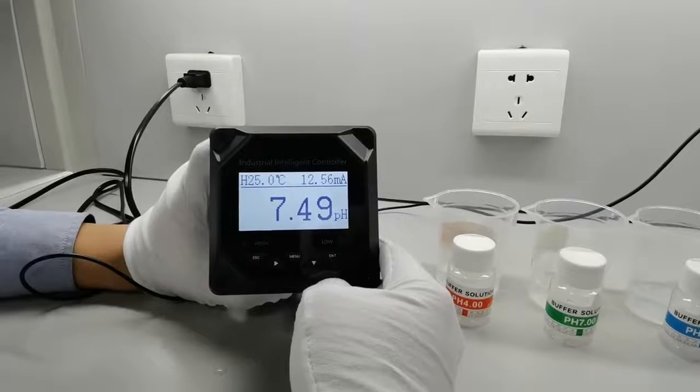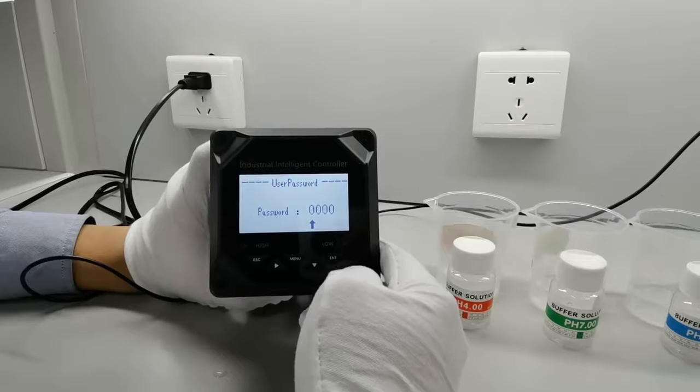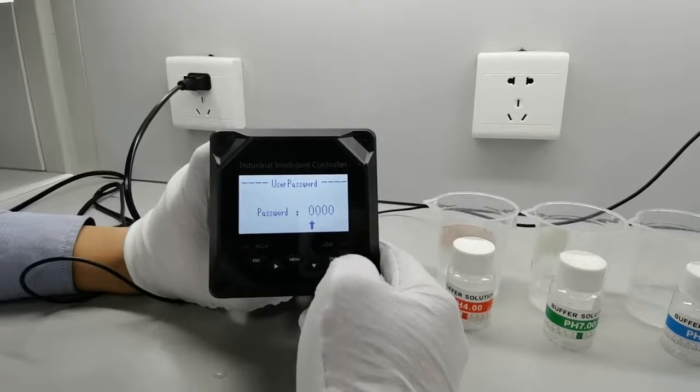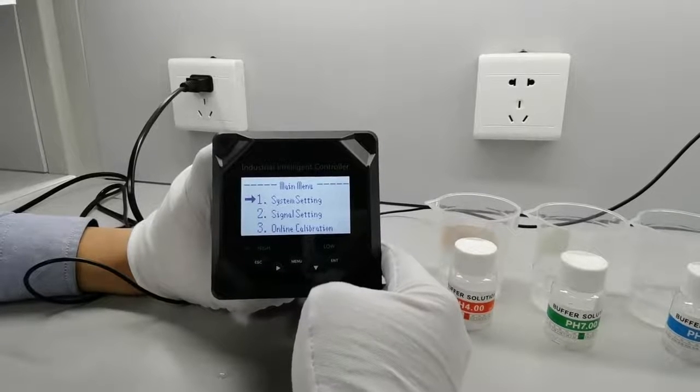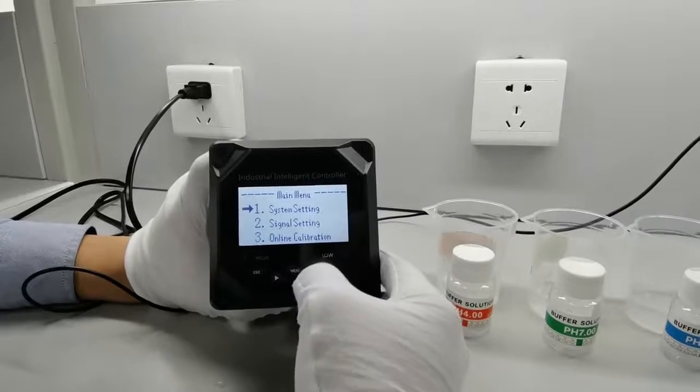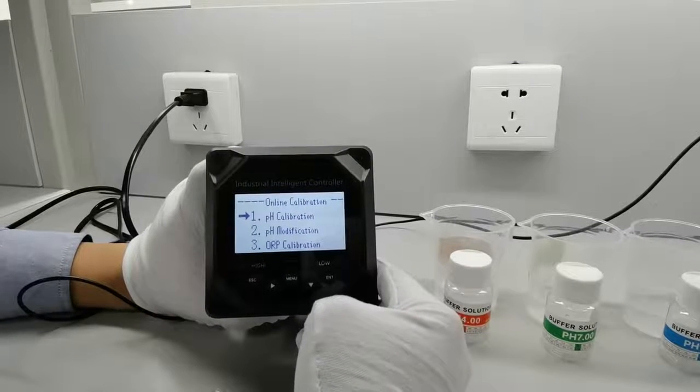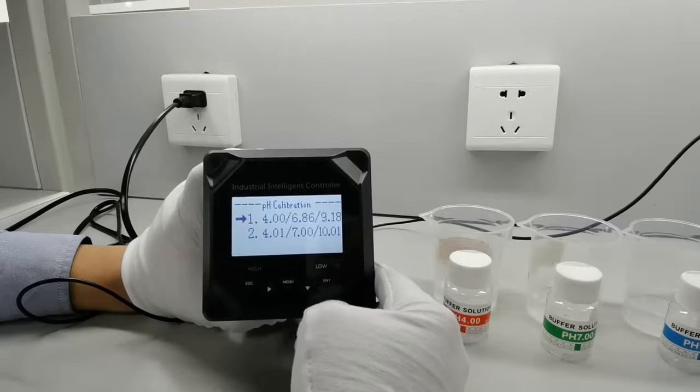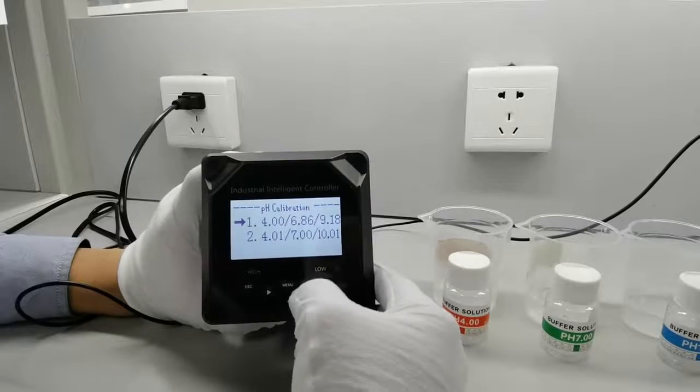Press menu and then enter the password 0000. Next, go to online calibration, then pH calibration, and select pH 4, 7, and 10.